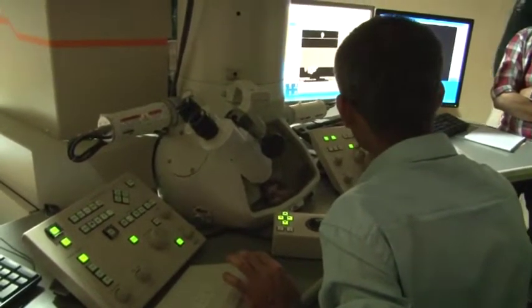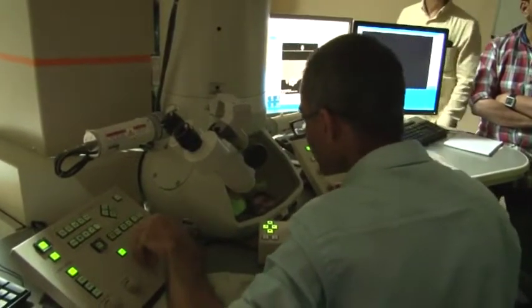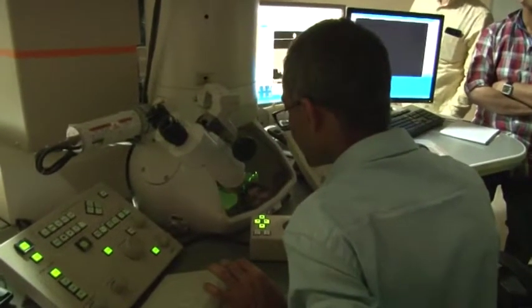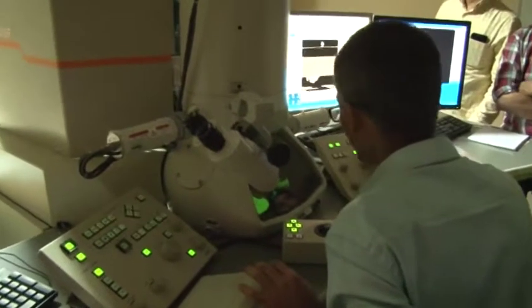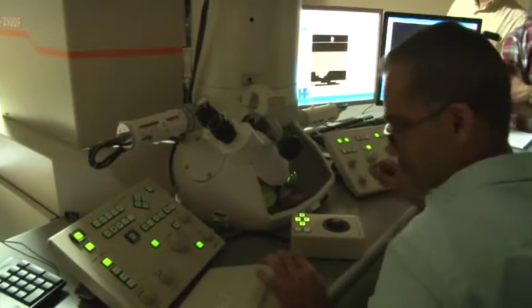In diffraction mode, to change the camera length, you use the same knob which is called the magnification, like in image mode. It just switches from the image mode to, let's call it, magnification and diffraction mode. So it's just the same twin knob, so there's nothing special about it.